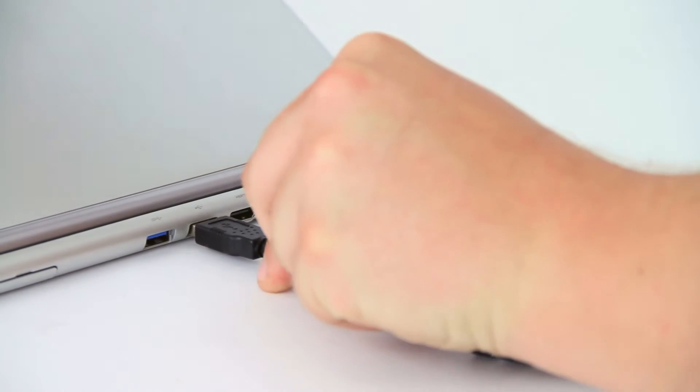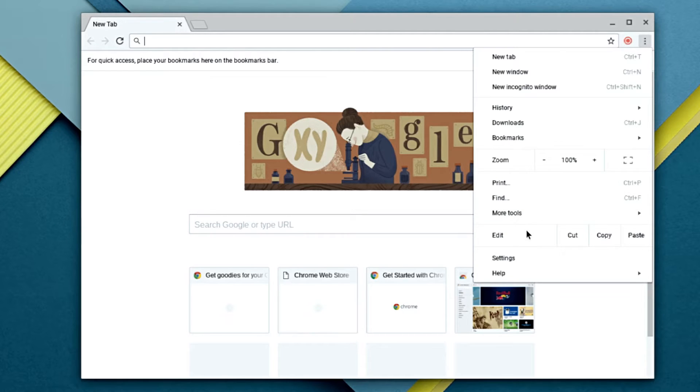To use a Dynolight with a Chromebook, simply connect the Dynolight to the USB port, then from the Chrome browser options menu, select Settings.